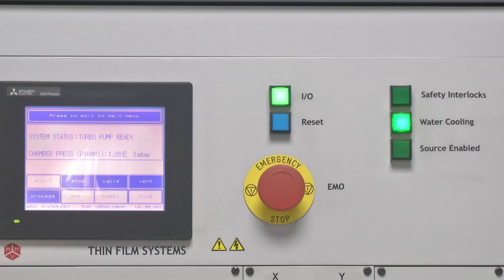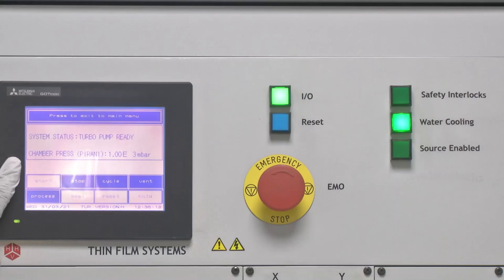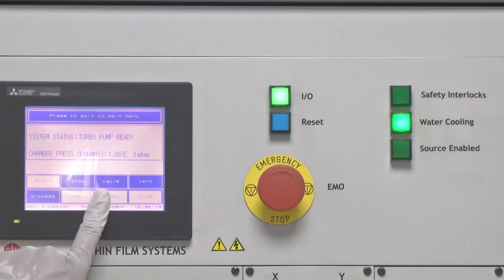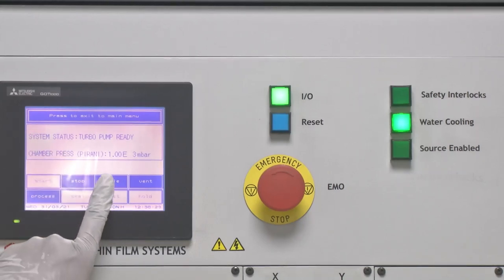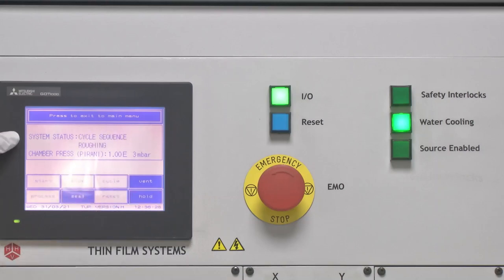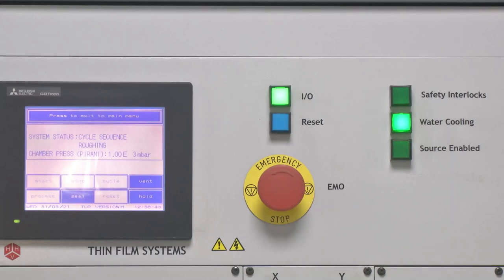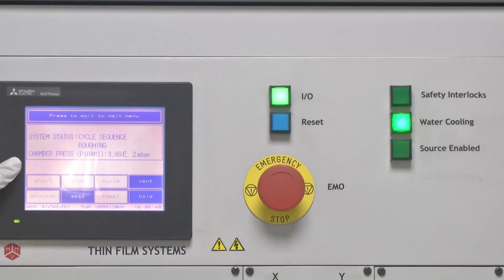The system status now shows that the turbo pump is ready; however, the chamber pressure is still 10 to the power 3 millibar, so we need to start the rotary pump. To do this, we press the highlighted button 'cycle.' The system status changes to 'cycle sequence roughing,' meaning the roughing valve is open and roughing pressure is being created using the rotary pump. The chamber pressure starts dropping — from 10 to the power 3, to 4 × 10 to the power 2 millibar — and will quickly reach 10 to the minus 3 millibar, typically within 5 minutes.